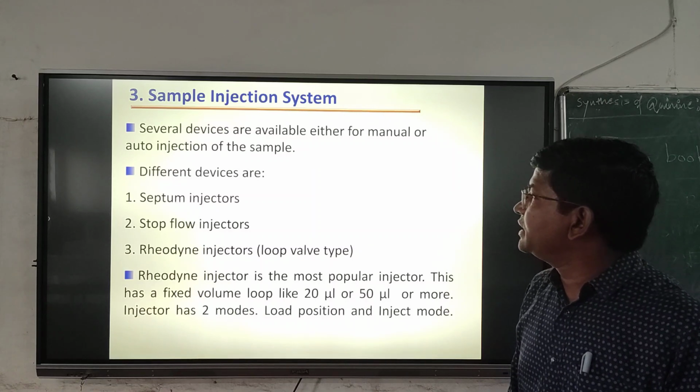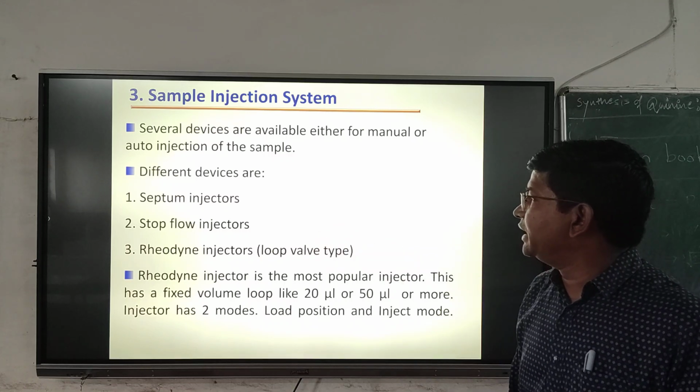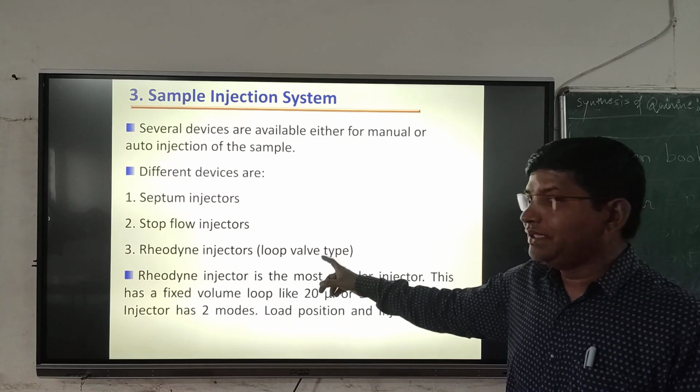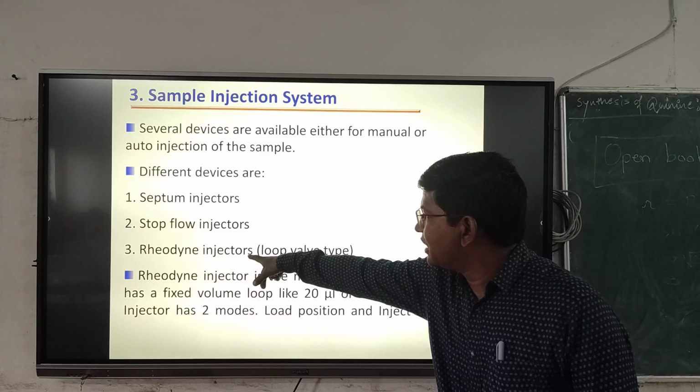For the sample injection system, we have a septum injector, a stop flow injector and a Rheodyne injector. Generally in HPLC we use the Rheodyne injection system.